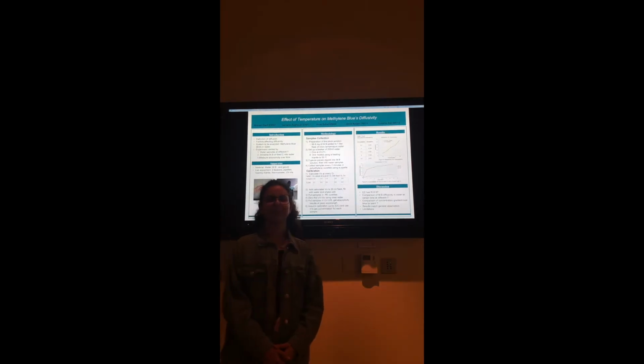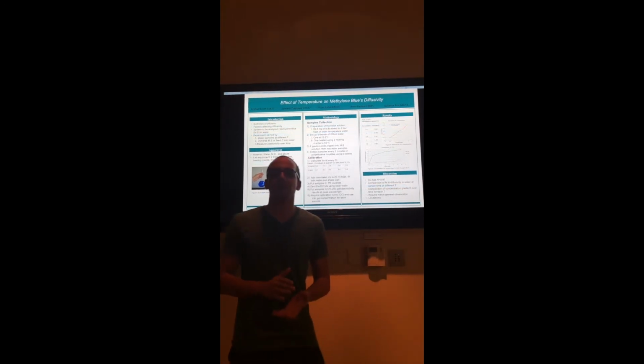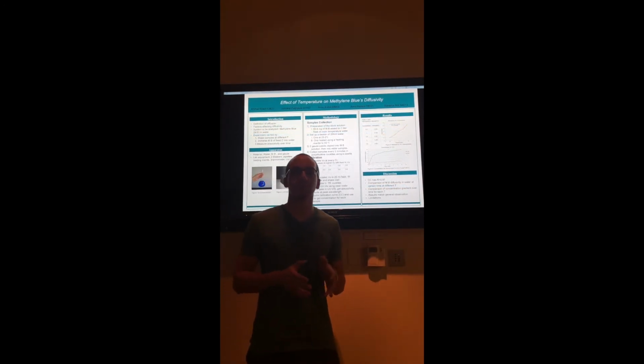Everyone, and now I will leave you with my colleague Ahmed to talk to you about the results. Hi guys, my name is Ahmed and I'll be discussing the results and the discussion of our experiment. So by now we have prepared 16 different samples of our solutions.